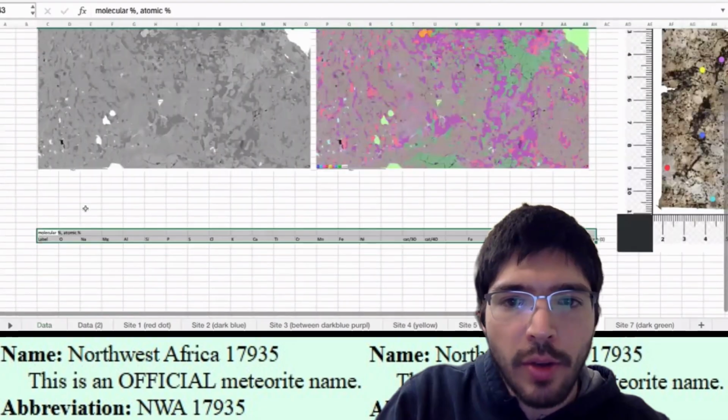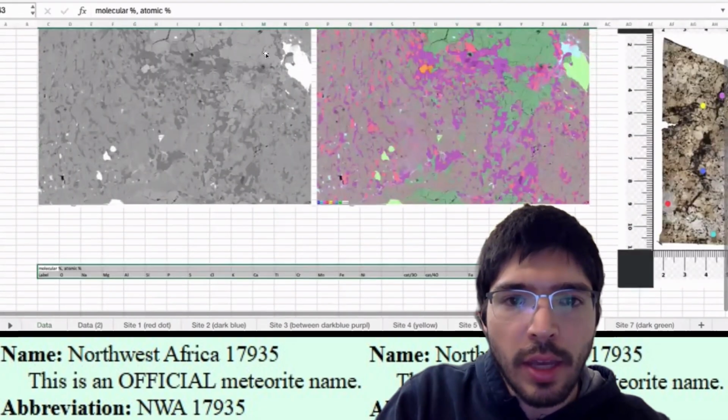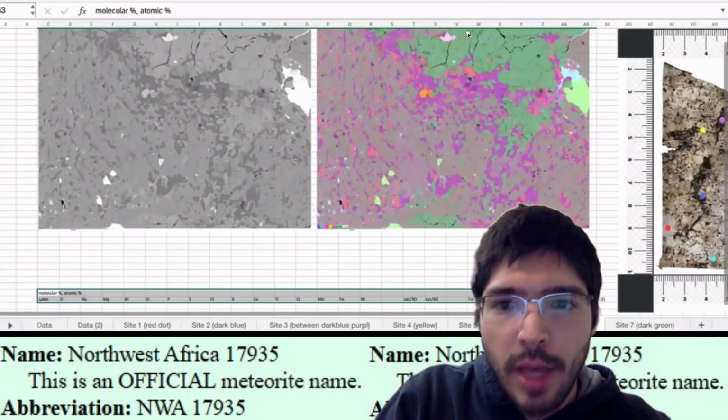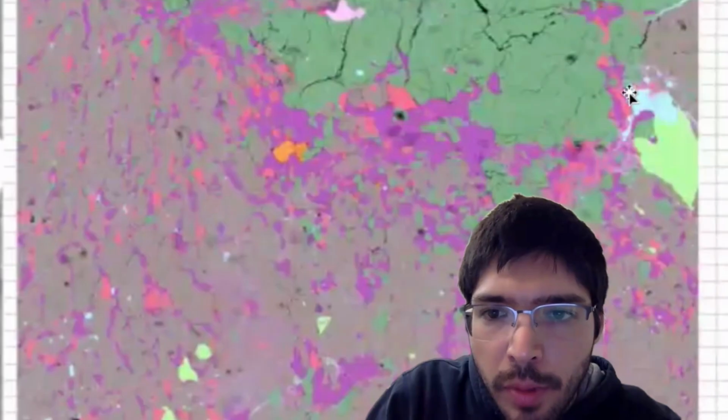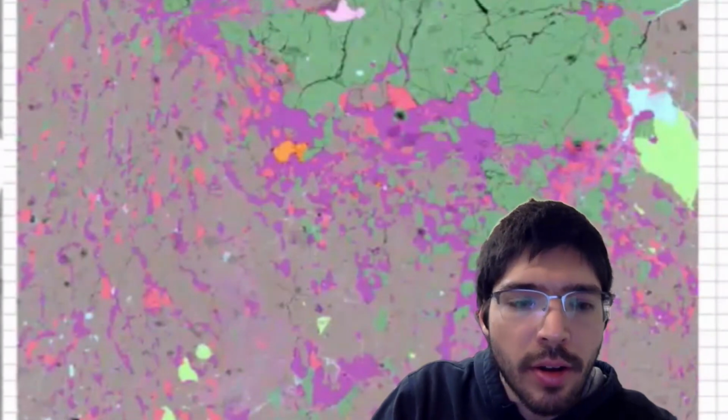And the other way you can check is using some of our images right here. I don't know if you can see it, but this is yellow, this is a troilite, and then this is a metal, this blue right here. But right on this upper right edge, you'll see the color is a bit faded, and you'll see here it sort of looks more gray. That's clearly a sign of weathering of the metal. You can see this is an oxidation process there.